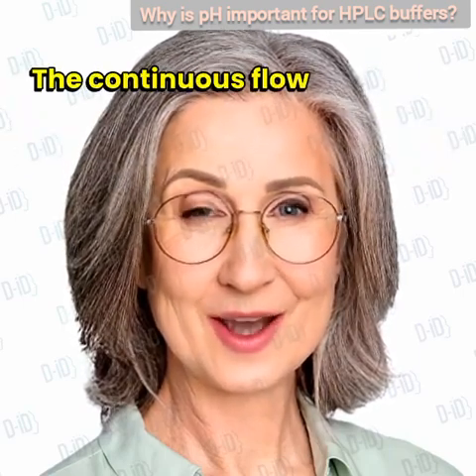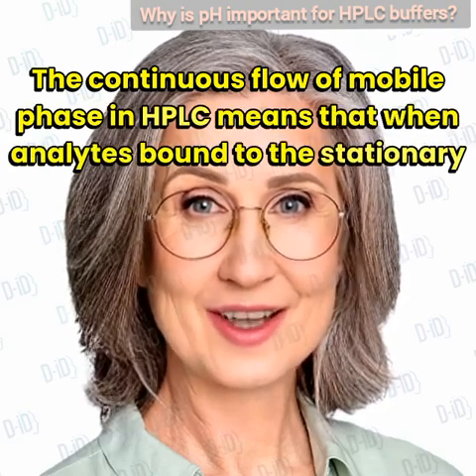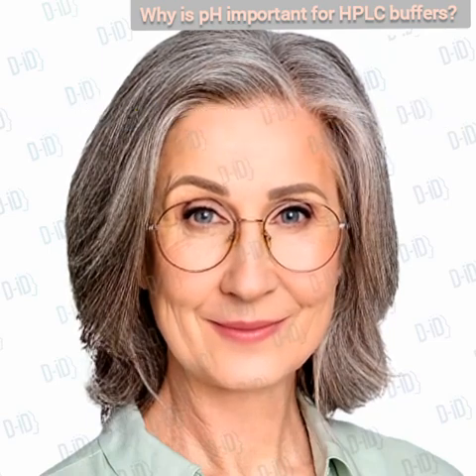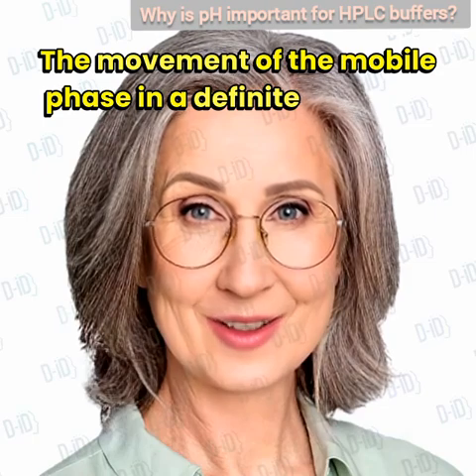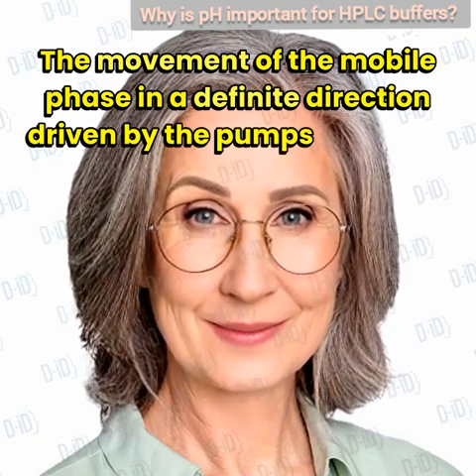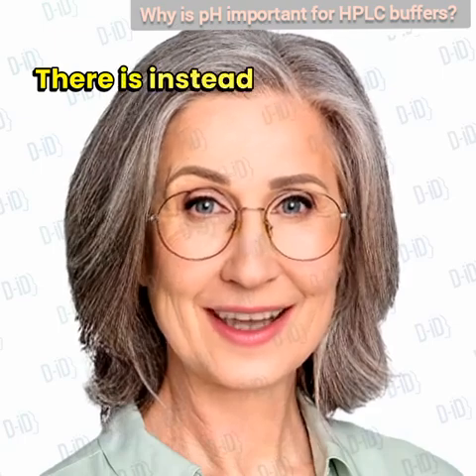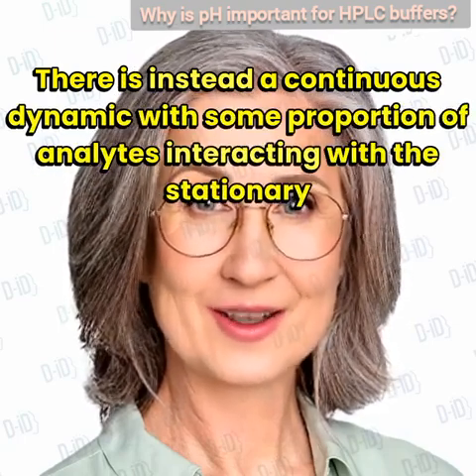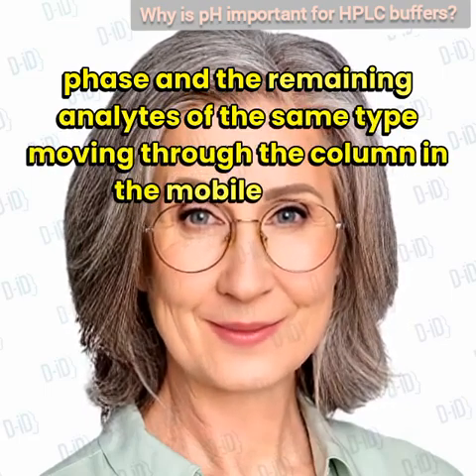The continuous flow of mobile phase in HPLC means that when analytes bound to the stationary phase enter the mobile phase, they are transported along the column. The movement of the mobile phase in a definite direction, driven by the pumps, therefore means that an equilibrium is never reached. There is instead a continuous dynamic with some proportion of analytes interacting with the stationary phase and the remaining analytes of the same type moving through the column in the mobile phase.